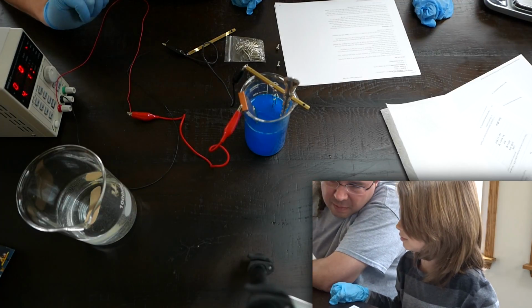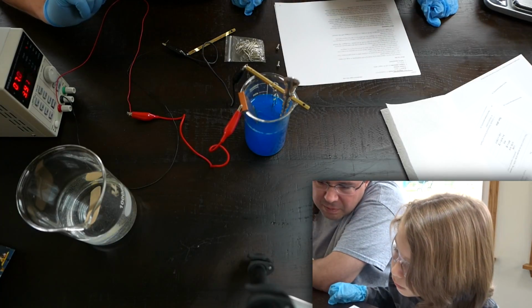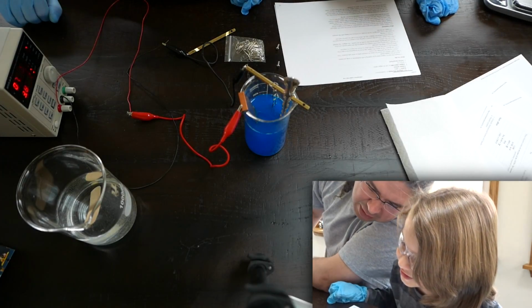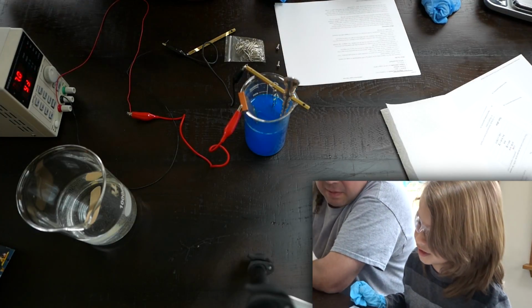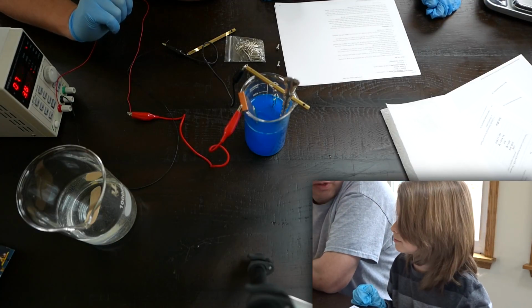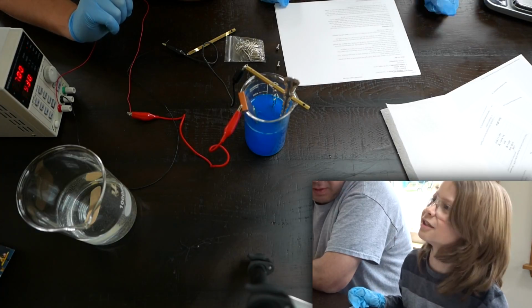Can we see anything going on in there? Nothing bubbling? Nothing's bubbling, but I can already see it turning to copper. Can you really? Yes. The sides are turning copper. So I guess we should let this go for a couple minutes and then come back, right? It says until you're happy. Let's let them watch.